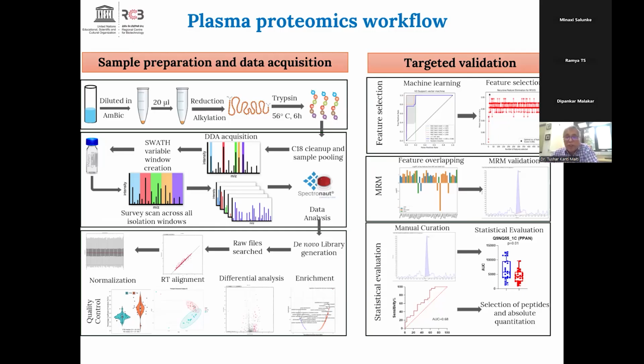This target is then validated by multiple reaction monitoring mass spectrometry using high resolution mass spec, the HRMRM system in the ZenoTOF mass spectrometer. Subsequently, we built a model and classified whether this particular molecule can predict preterm birth versus term birth with sufficient accuracy and precision or not, using a separate subset of samples in the validation cohorts.